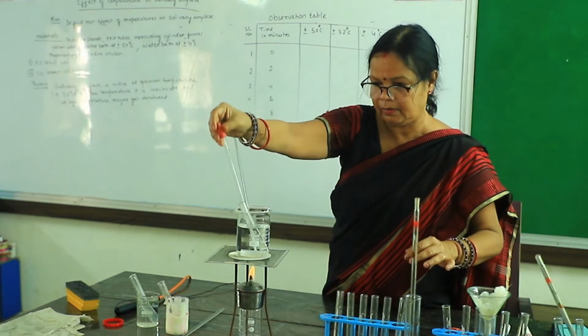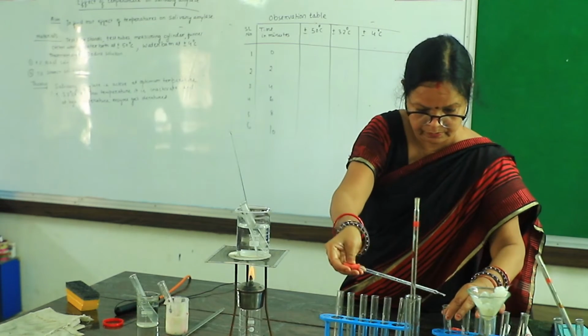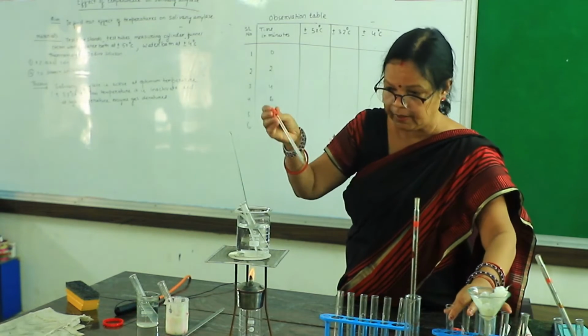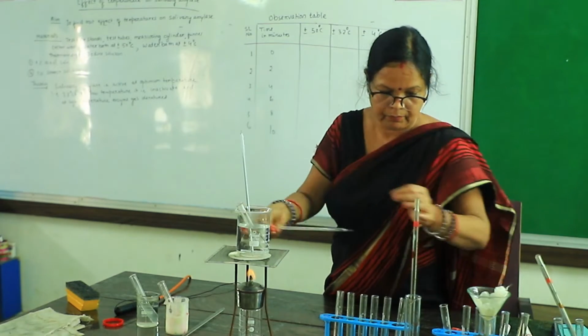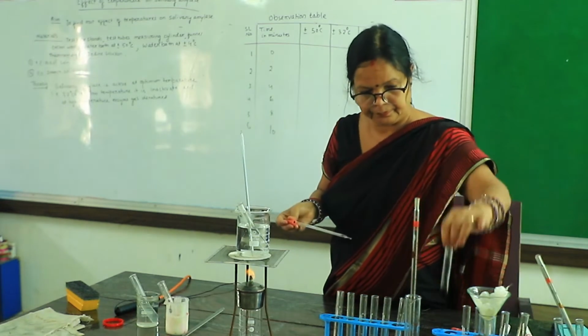Okay, 2 more drops. It will turn to blue black color.